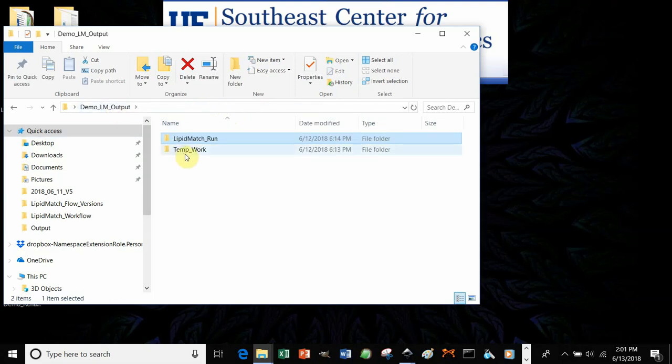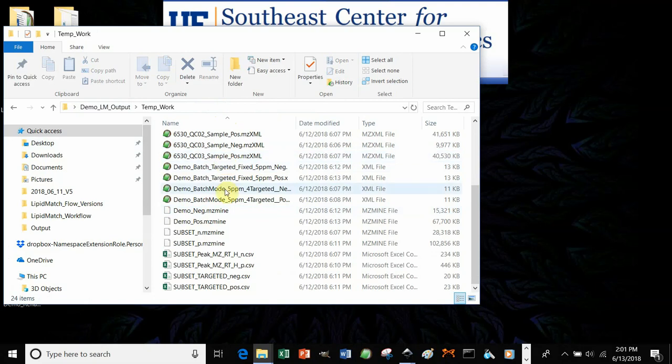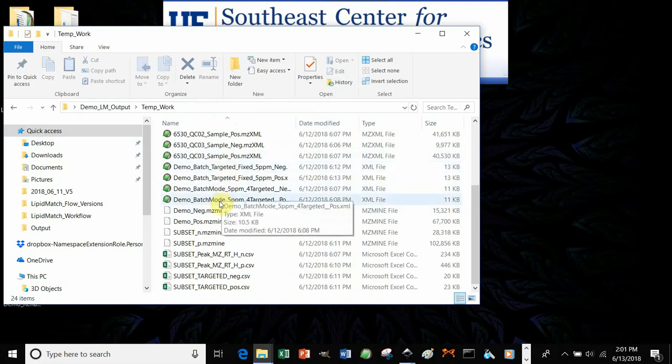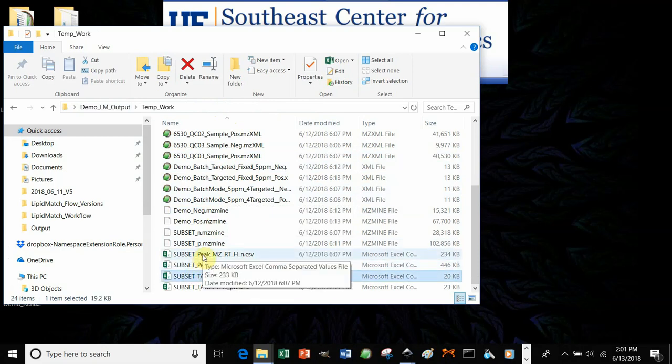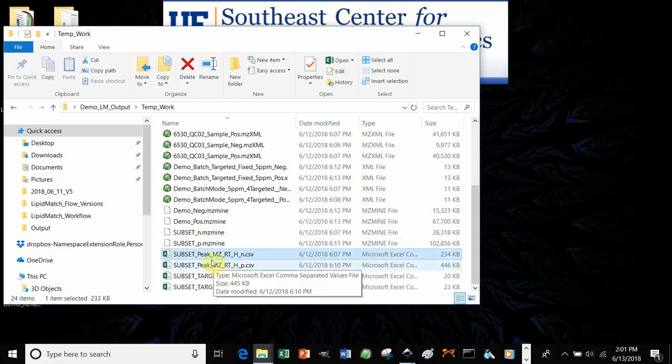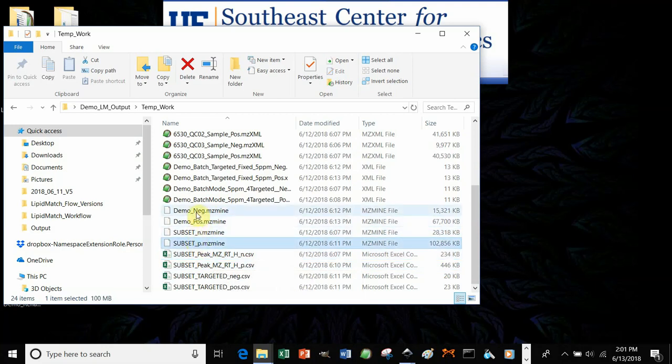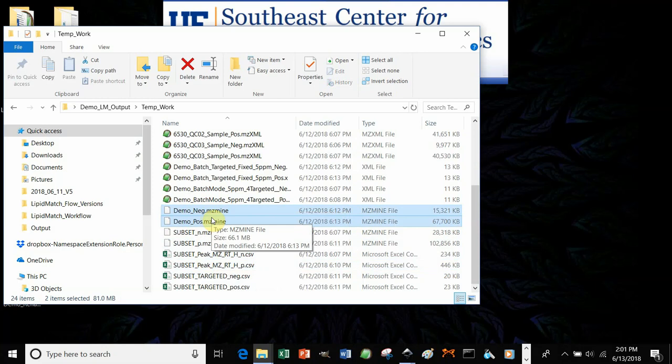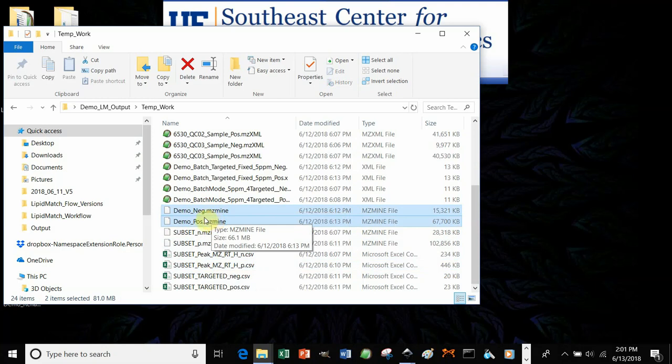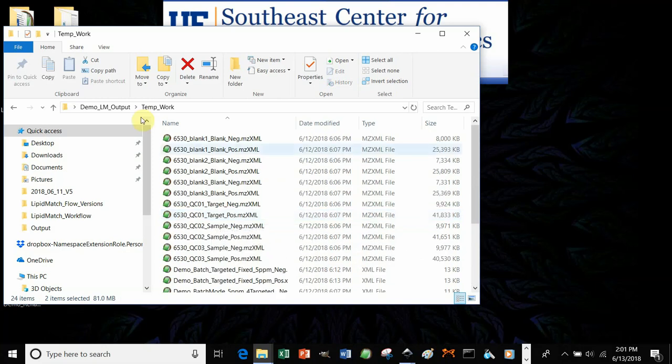So we talked about the temporary work, having the mzmine converted files. It has the batch files, so you can see the parameters there as well. It also has CSV files with the feature tables that were created, and the mzmine files. So you could open up these mzmine files. You want to take the demo ones, or whatever your project name was. Those are the final mzmine files. Open them up in mzmine, and you can actually scroll through the peaks that were detected, if you want to look more closely at the peak detection.